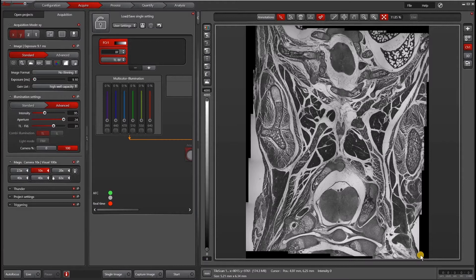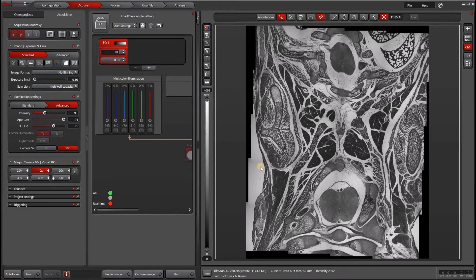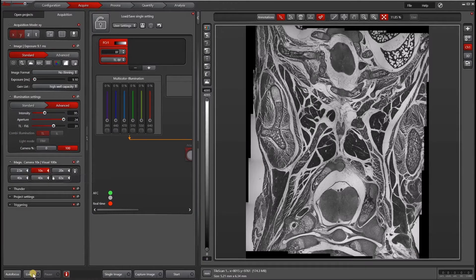The first thing we're going to do is make sure you're on an objective that is lower mag. Currently I'm on the 10x, 5x also works well.